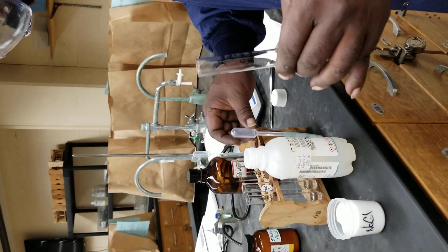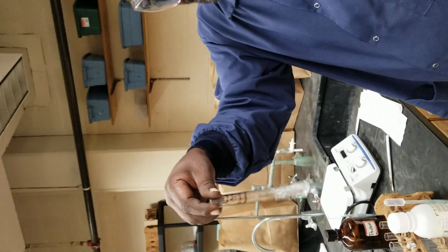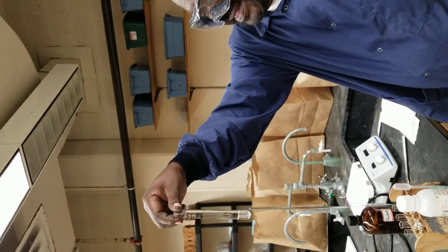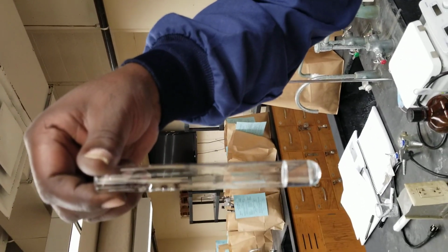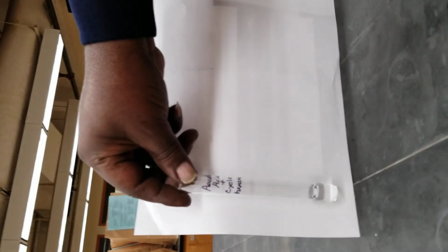That's a little storage thing there. Shake it. Look in the bottom, nothing. Look for layering, nothing. So, again, just to be sure, acetic acid and cyclohexane. All right, moving right along.